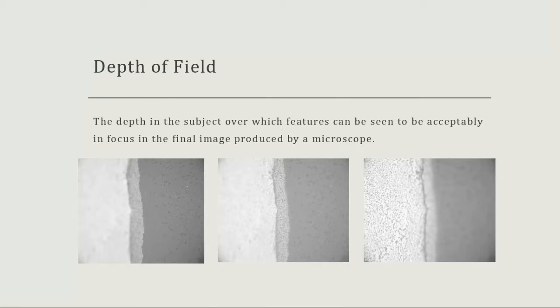Well, below you can see these three images here, okay? And the depth of field, let me use a blue marker. This one is in focus, but this one is not in focus, and the one on the end, I'll make it red because it is not in focus.